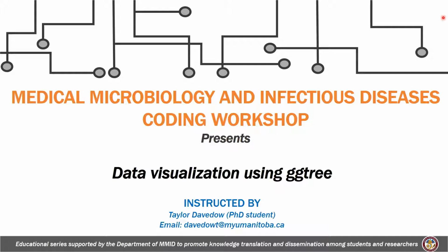So the instructor for today is Taylor Davedow, and she's in her second year of PhD studies at the University of Manitoba in the Department of Medical Microbiology and Infectious Diseases, and she's being supervised by Dr. Celine Nadon. So today, Taylor is going to provide us with an introduction to ggTree, where she's going to focus on how to import the tree data, as well as build some basic skills in visualization and annotation of trees. All right, Taylor, the floor is yours.